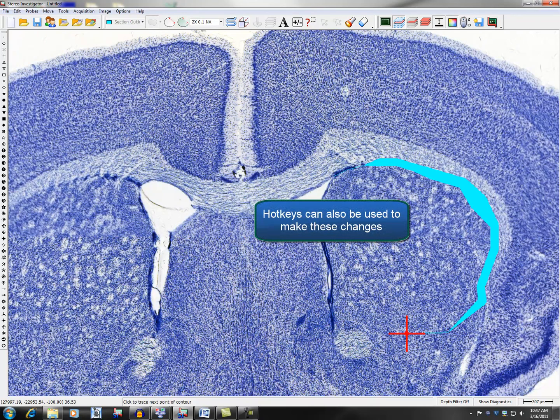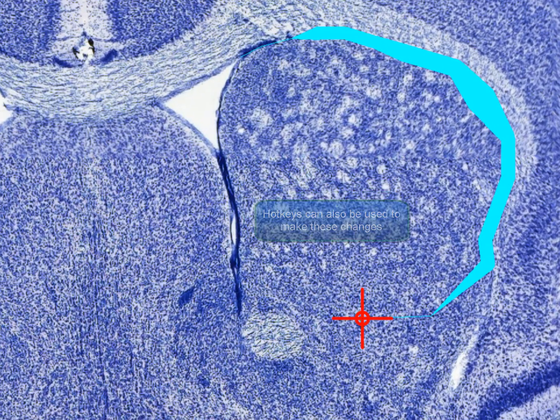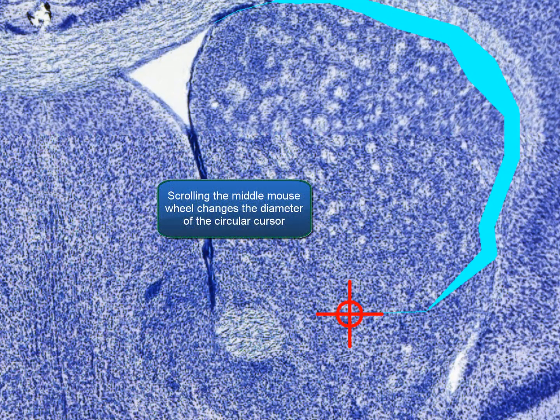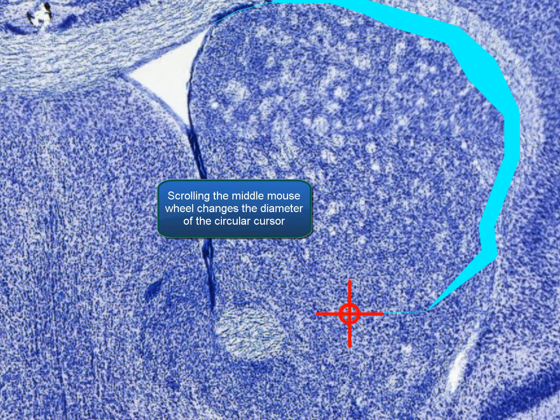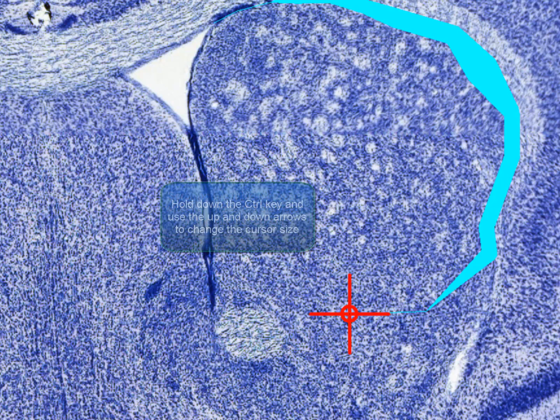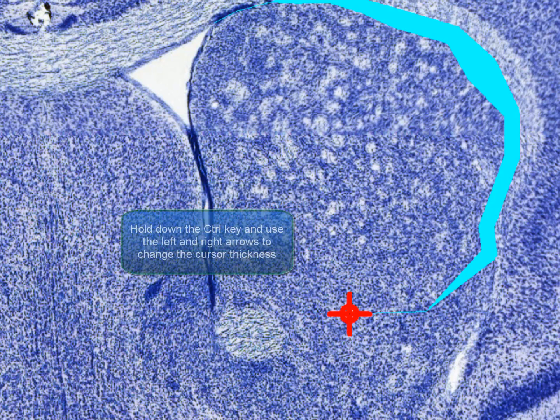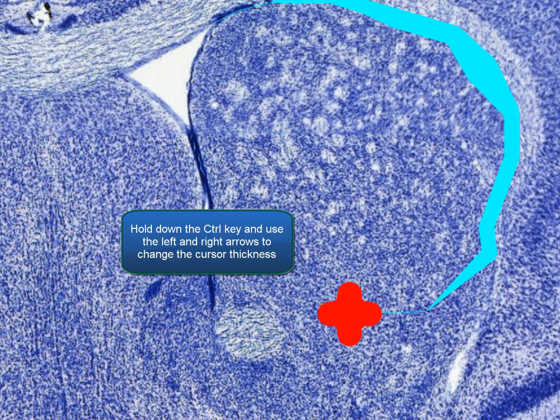Hotkeys can also be used to make these changes. Scrolling the middle mouse wheel changes the diameter of the circular cursor. Hold down the CTRL key and use the up and down arrows to change the cursor size. Hold down the CTRL key and use the left and right arrows to change the cursor thickness.